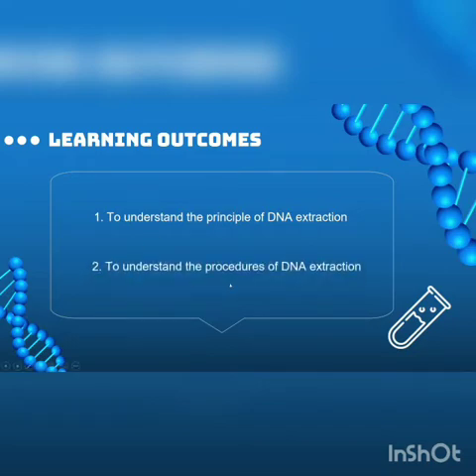Next, we can understand the procedure of DNA extraction. We can know the exact procedure to complete the experiment for a better result. We can also apply the precaution steps in the experiment and keep an eye on them so the result will be more accurate.